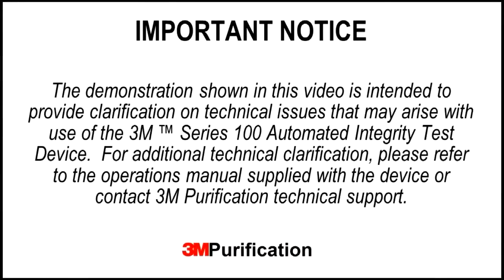The demonstration shown in this video is intended to provide clarification on technical issues that may arise with use of the 3M Series 100 automated integrity test device. For additional technical clarification, please refer to the operations manual supplied with the device or contact 3M Purification Technical Support.